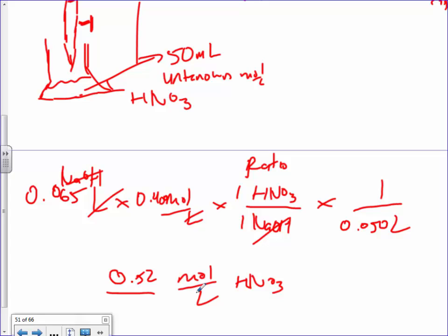How do you measure a mass of something? Well, you just weigh it on a scale. How do you measure a volume of something? Well, you use some sort of measuring device like a pipette, a volumetric flask. But here's the hardest question. What if you want to know something's concentration? There's no device where you just put a beaker of something on there, find its concentration, and it just tells you a number. Does that make sense?